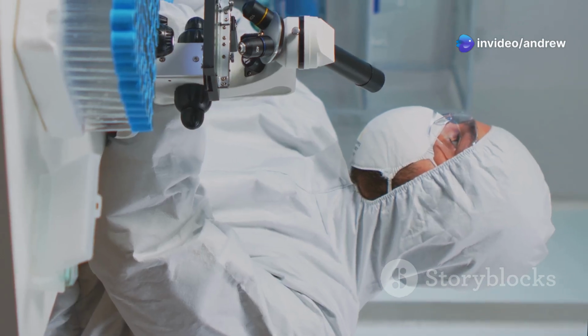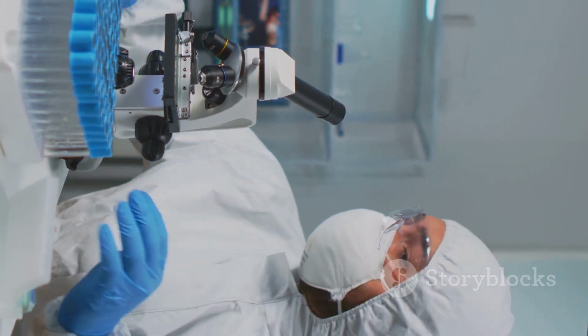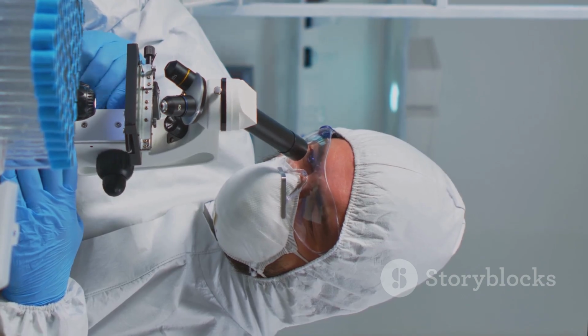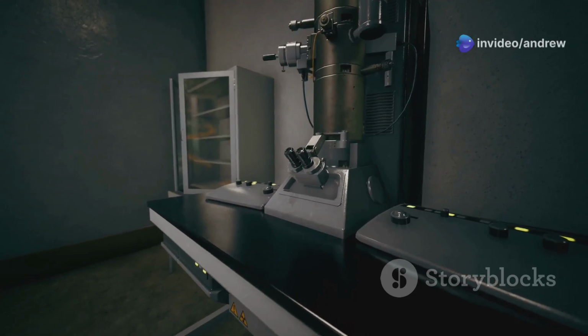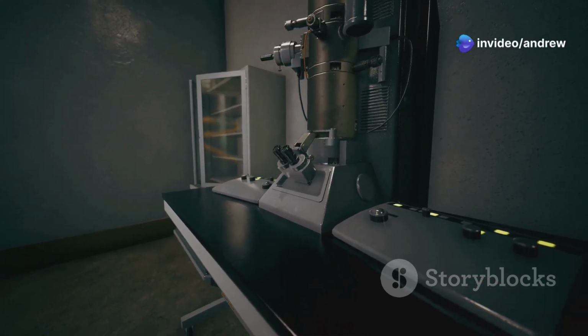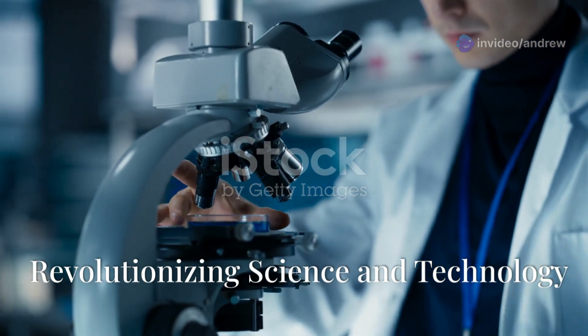REM strengths: extremely sensitive to surface features, can reveal atomic arrangements on surfaces. Limitations: requires very flat and clean samples, limited to surface analysis. The choice of instrument depends on the specific research question and the nature of the sample being investigated.